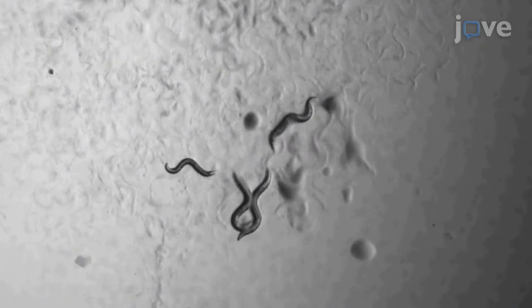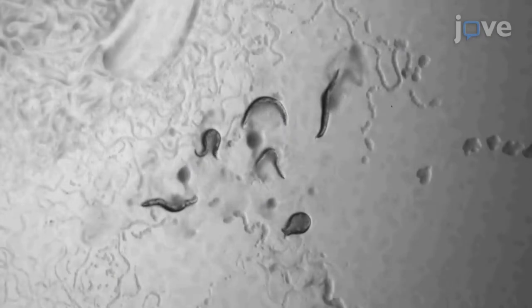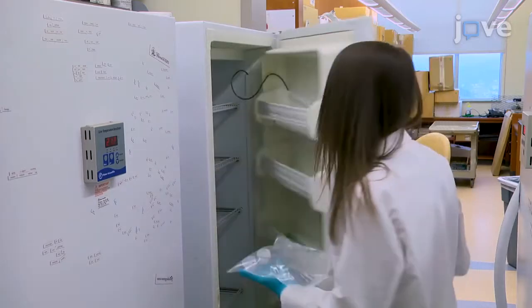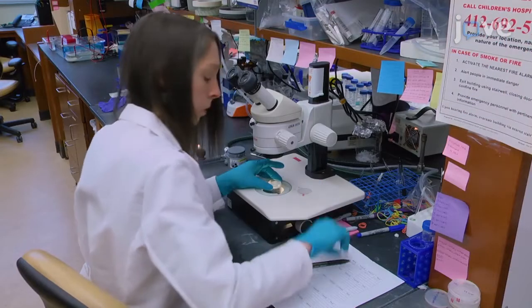When attempting this protocol, the major challenge is obtaining consistent RAN peptide toxicity and expression. The major factors to control include growth temperature, timing of temperature shifts, and preparation of assay plates. It is important for experimenters to consistently classify the phenotypes of the animals in this age-dependent process assay. Visual demonstration of this technique shows their classification criteria.